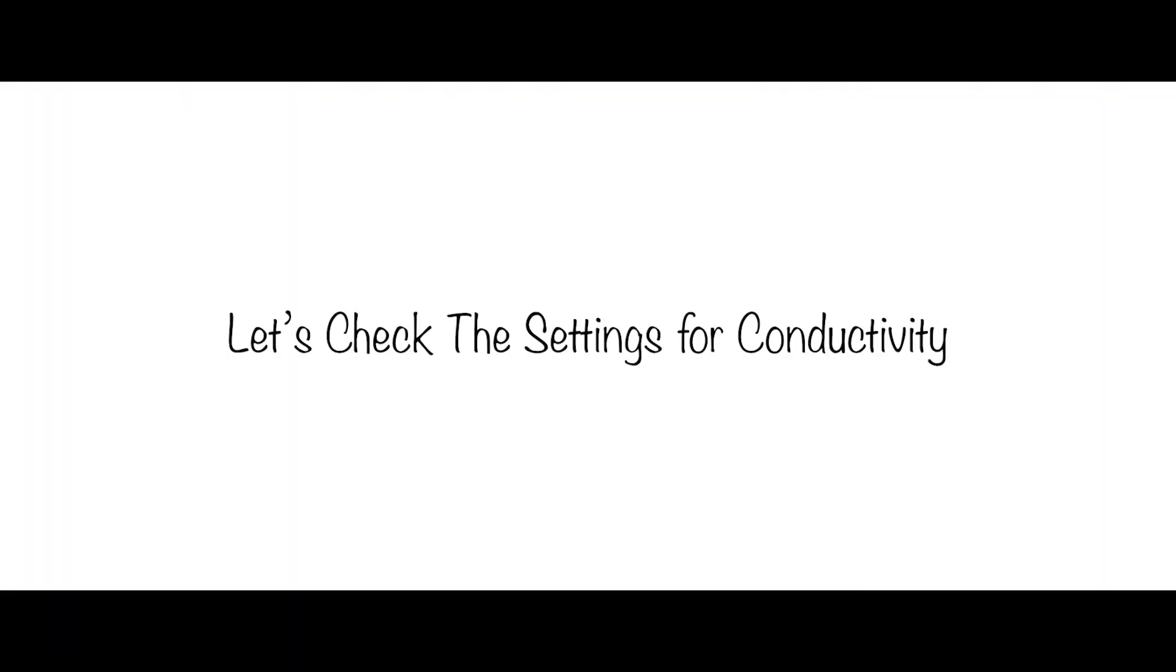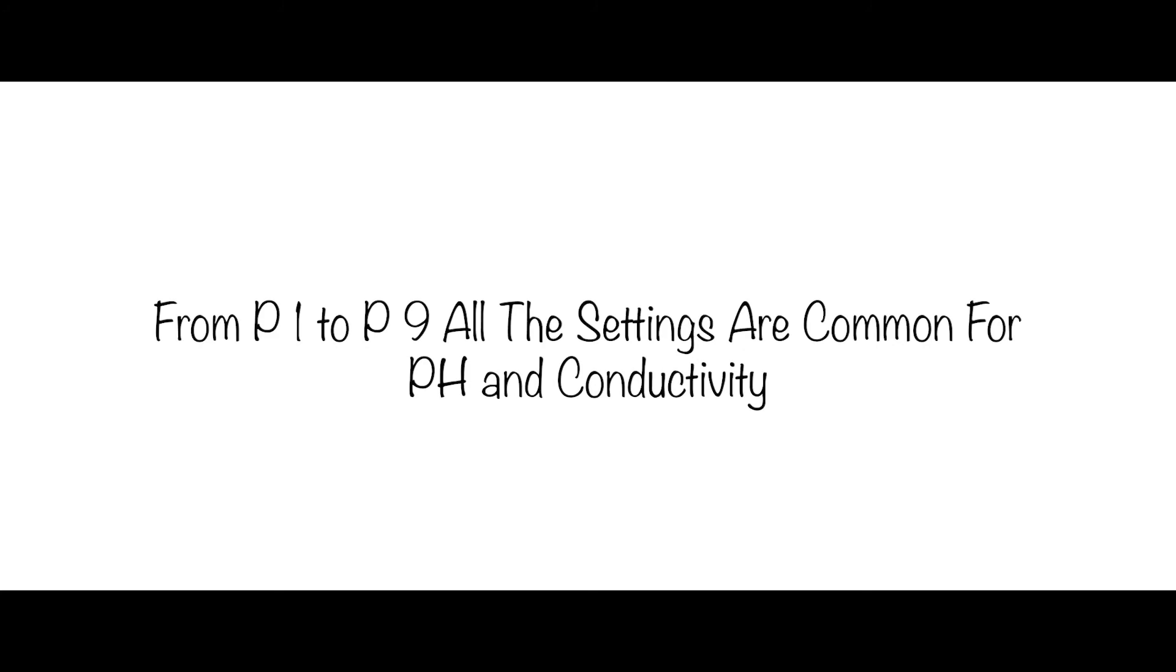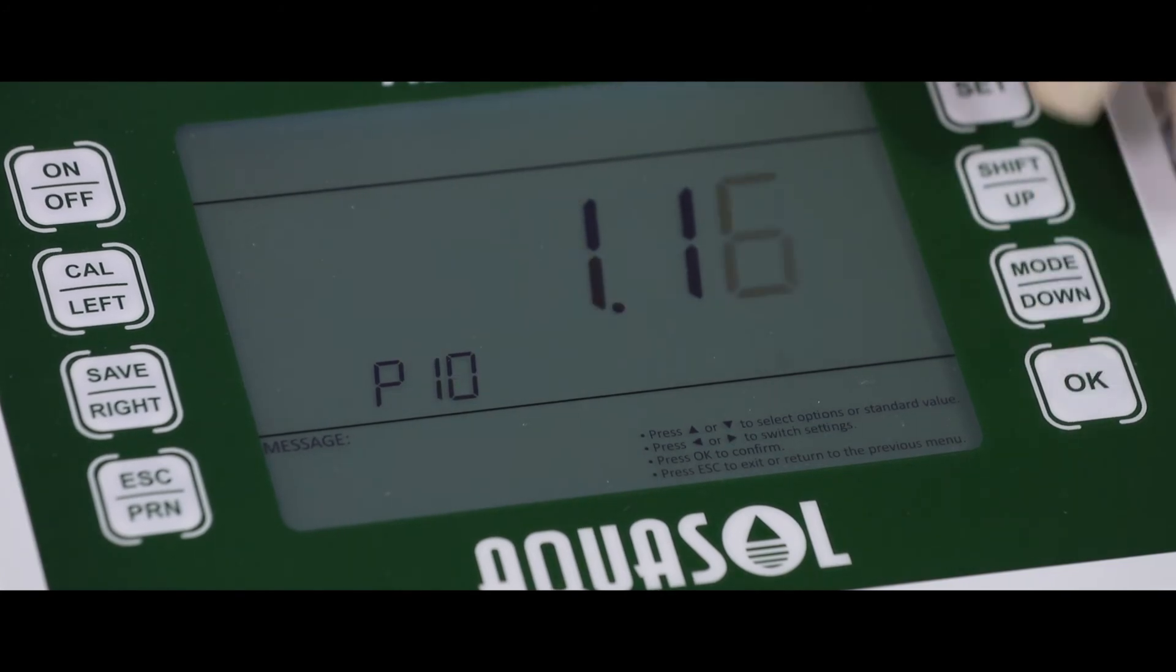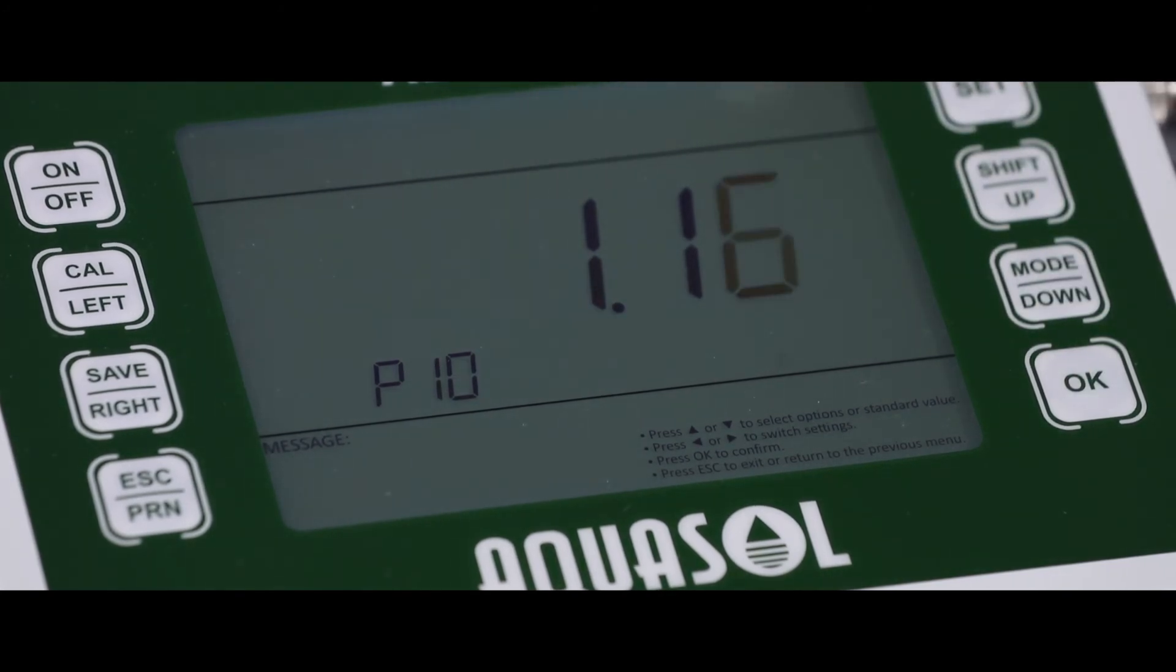For conductivity setting, change the mode to conductivity. From P1 to P9 is common for both the settings. P10, conductivity electrode coefficient value settings.